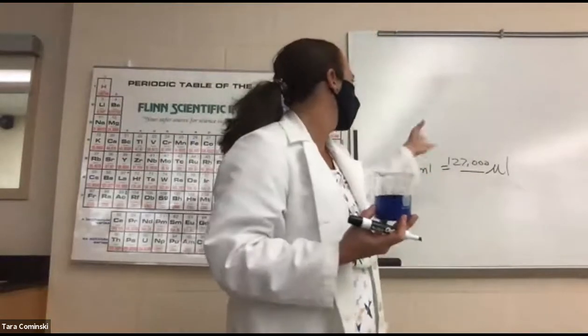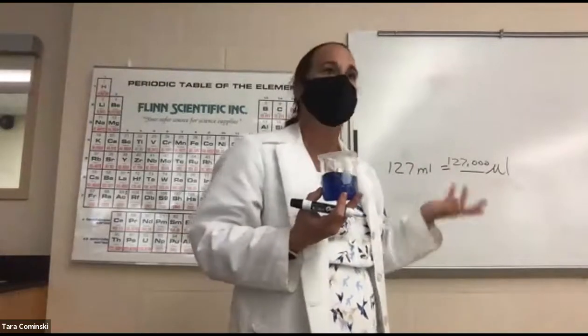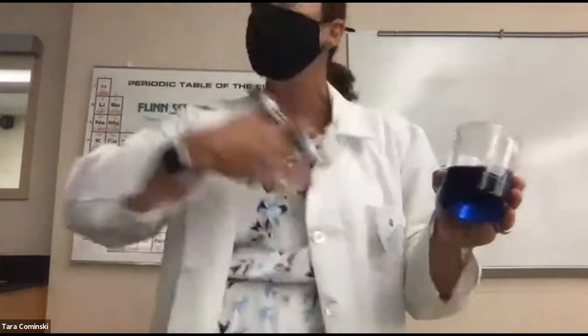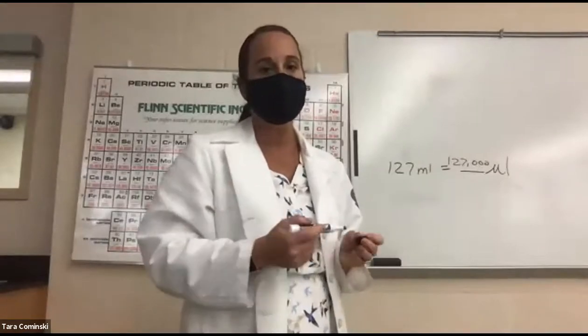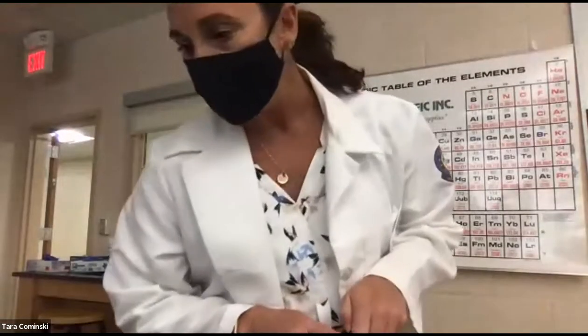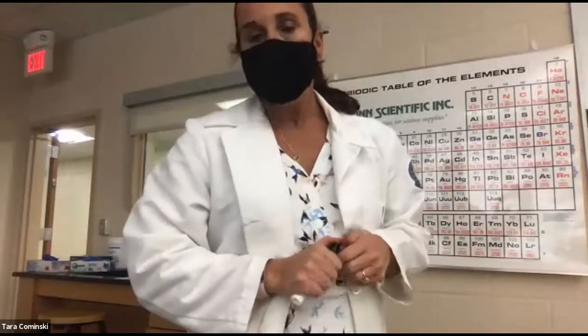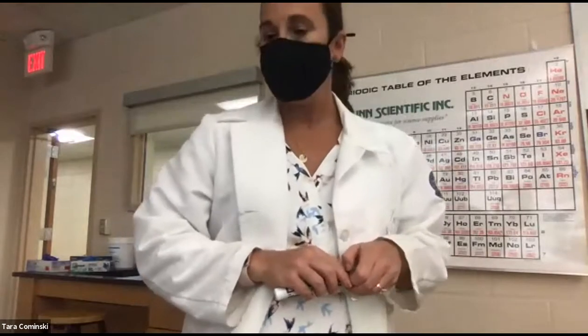Now, usually you wouldn't do that conversion, but if you have a smaller amount of milliliters, you may need to do that in the lab, go back to microliters, okay? You guys good over there? On Zoom, yeah? Okay. All right, so add in that conversion. You should write that one in, how much it is in microliters, okay? For number 5. You good? Okay, so we move on.